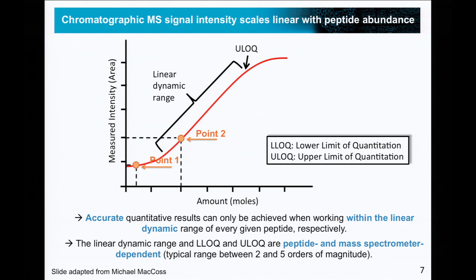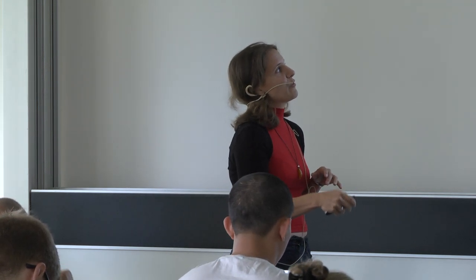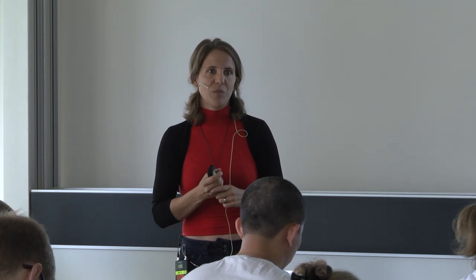And of course, working with these reference molecules, highly purified, this is very expensive, and this is why the vast majority of quantitative proteomics data haven't figured out this range of linearity, but what people typically do instead is they just assume that all their data comes from this linear dynamic range. This is what's typically done in the field, and I think it's very important that you are aware of this issue and that for highly accurate protein quantification, in theory, you would always first need to check that the underlying assumption is actually really valid in your measurements.